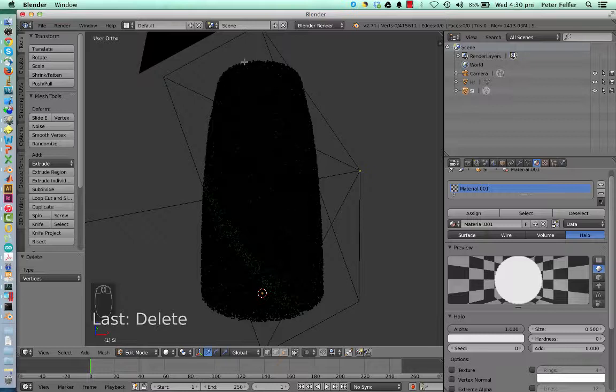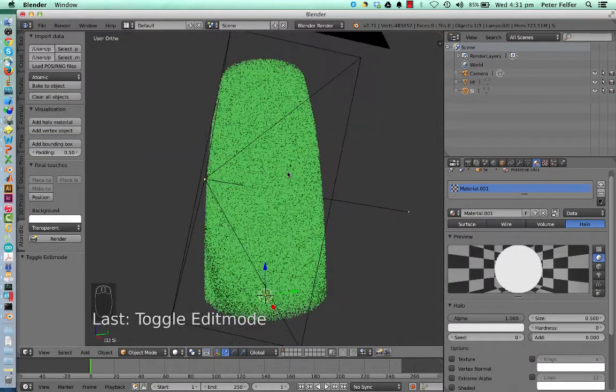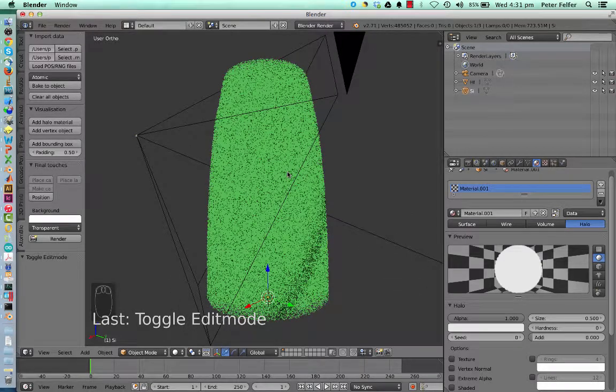So as you can see, some individual vertices by now. So if I go and select, you'll see I can select individual ones, or I can go and circle select, say a bunch here, and do stuff with them. But that's not what we're going to do anyway. So I'll deselect that and tab out of edit mode. And I think now we're getting a lot faster. Anyway, so we've done that.